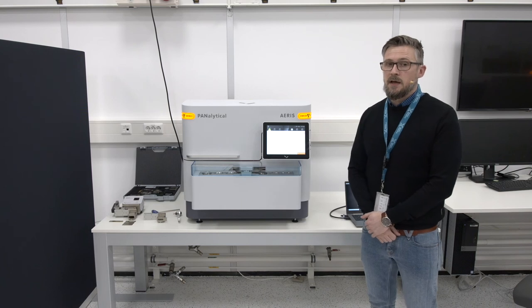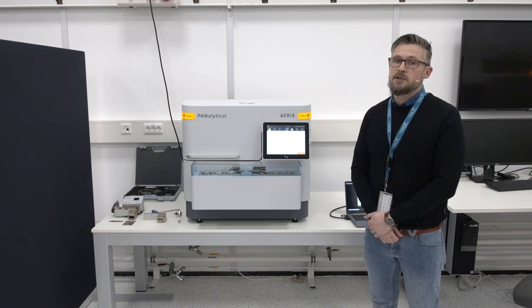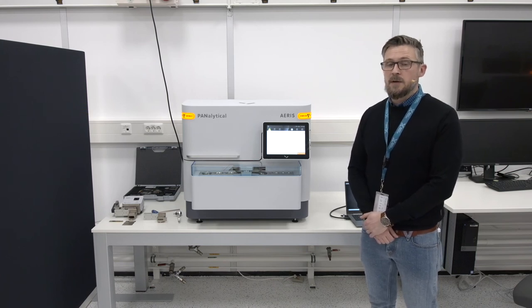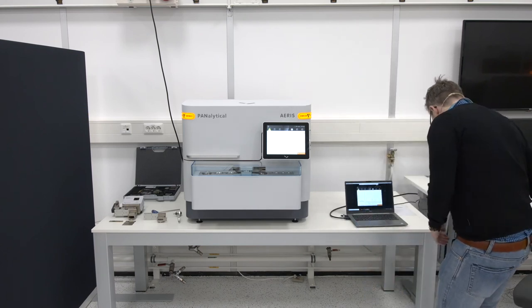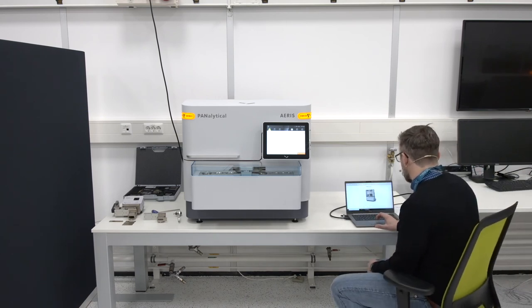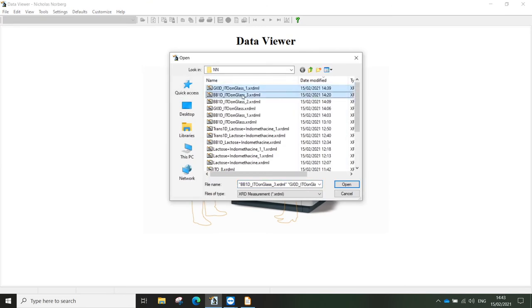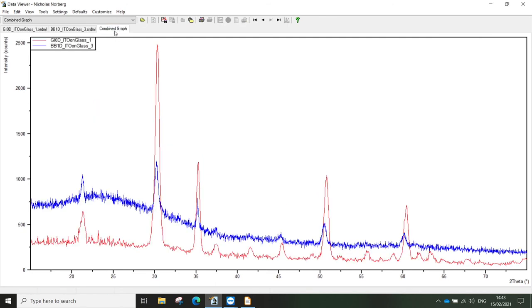The grazing incidence measurement has finished. To compare the two techniques, the best way is to look at the data directly in our data viewer tool. In the red scan — the grazing incidence scan — and the blue scan — the Bragg-Brentano scan — you can immediately see the benefits. In the red scan, the signal from the indium tin oxide layer on top of the glass substrate is maximized; we can clearly see all the different peaks even at high angles, which is not possible in the Bragg-Brentano measurement. The peak intensities are much higher, the peak-to-background ratio is much better, and the substrate signal is minimized.